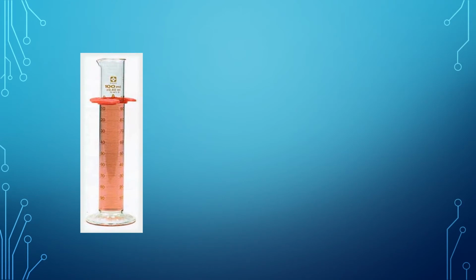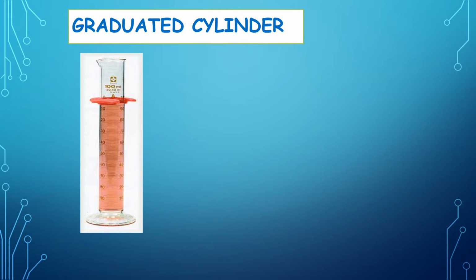Proceed. So you have also, what's the name? It is called graduated cylinder. What is the function of graduated cylinder? It is used to measure volumes of liquids. Example, chemicals or water. If you want to get the volume of the water, then you can also use graduated cylinder. It's either 100 ml, 200 ml, and so on.